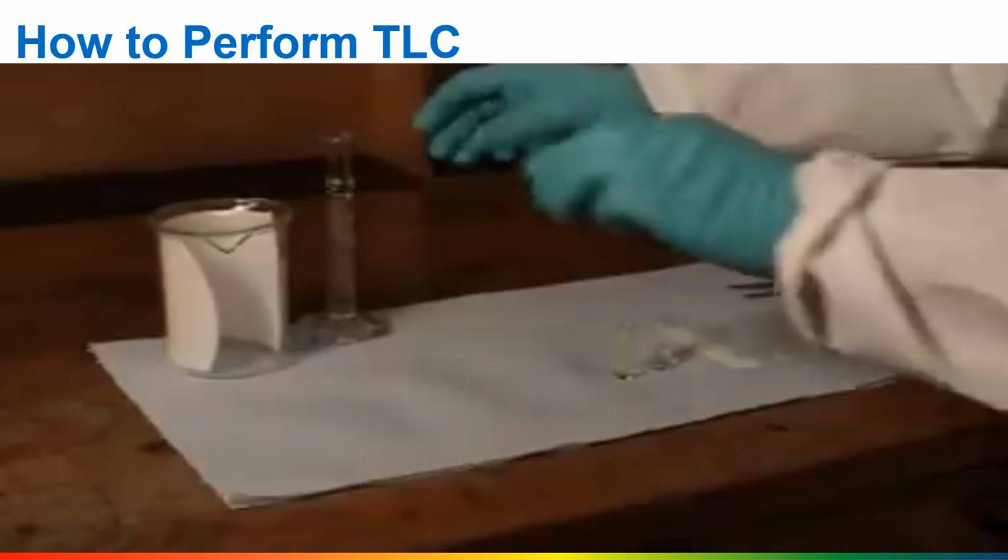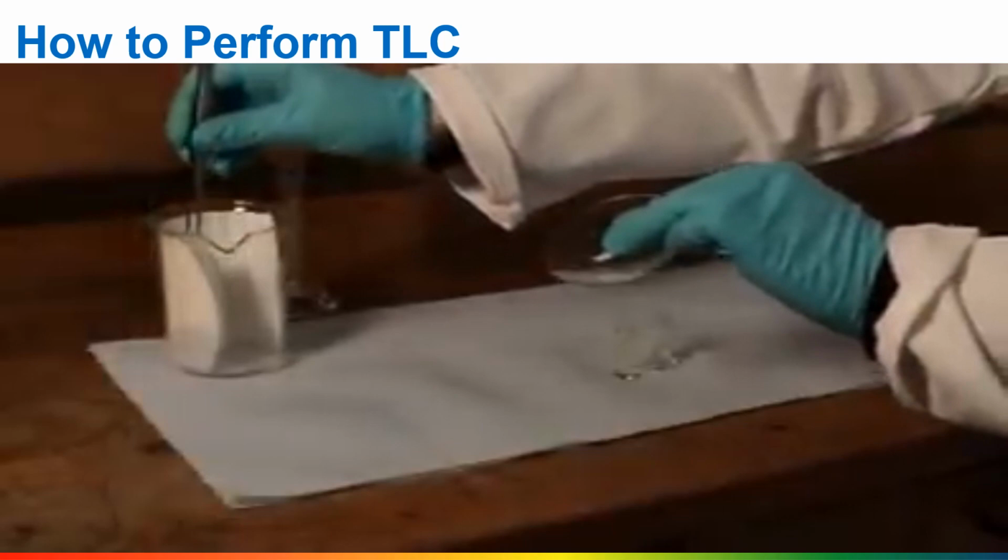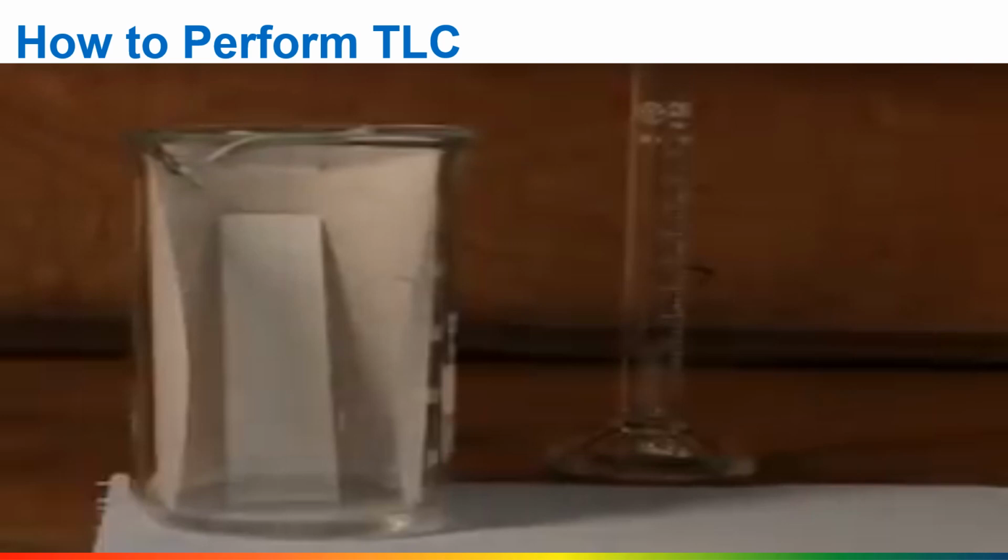We need to put the solvent into the chromatography tank to a depth of 3 to 4 millimetres. Usually you'll be told what solvent to use. Put the plate into the tank and put the lid on. You'll see there's a piece of filter paper in the chromatography tank, which is a beaker. This helps to saturate the atmosphere with solvent vapours.